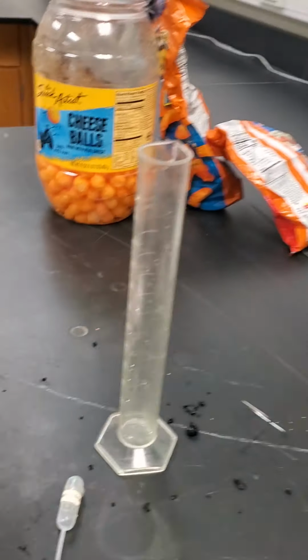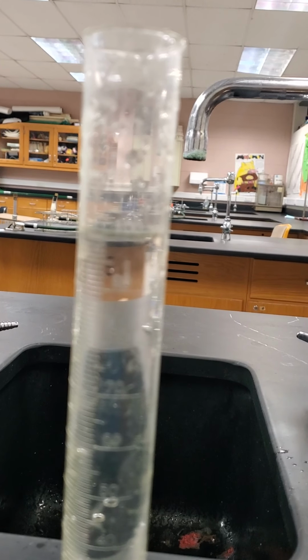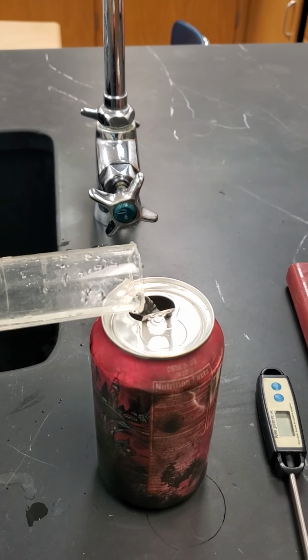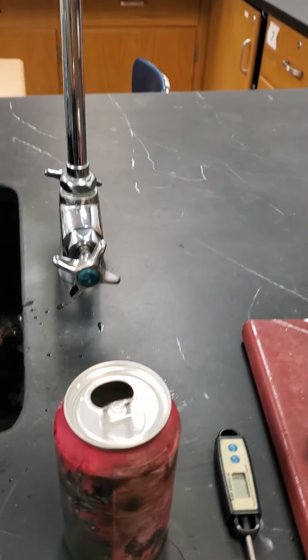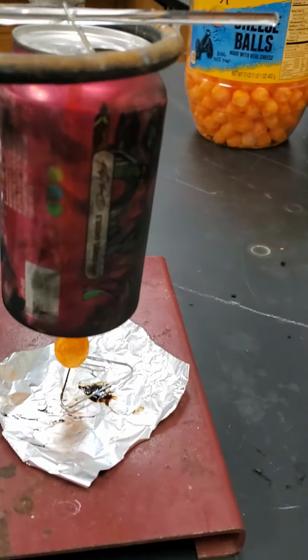Now, we're going to put water into our calorimeter. So our calorimeter setup looks like that. And we're going to put water into the calorimeter. Okay, so there's our water. I just use the pipette here to get it about there. Okay, then we'll go ahead and pour the water into the can. And then we'll set up our little apparatus there.